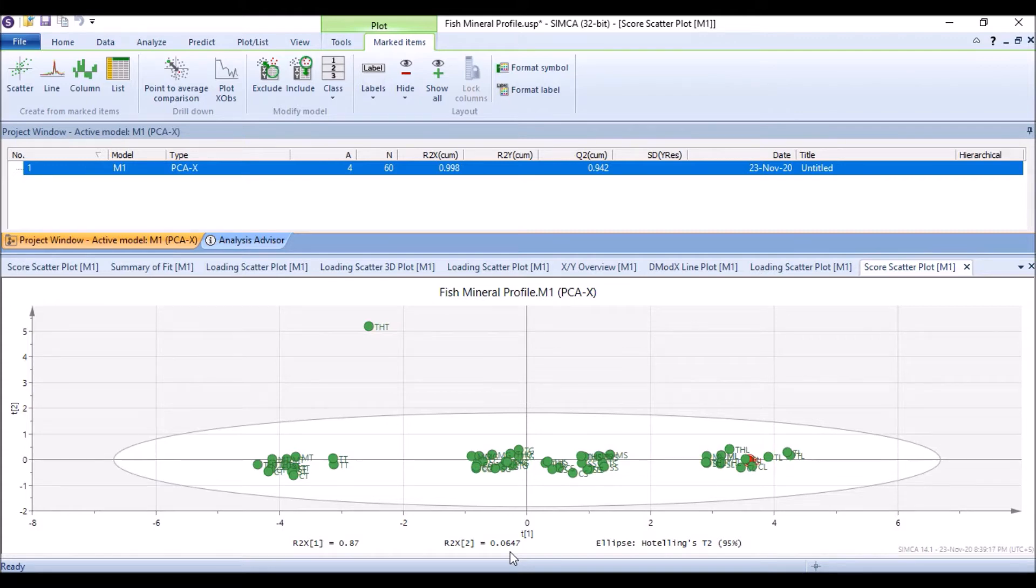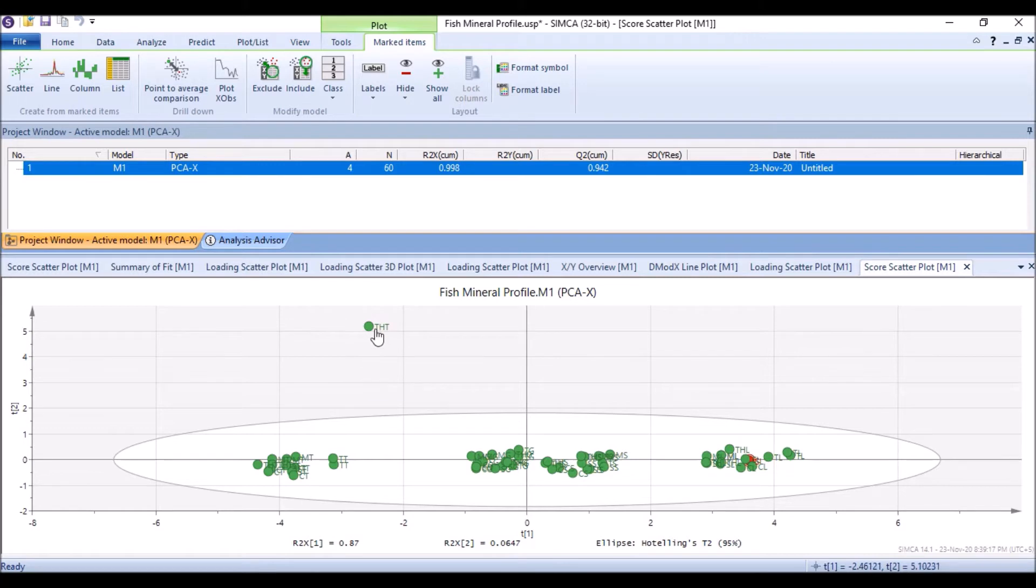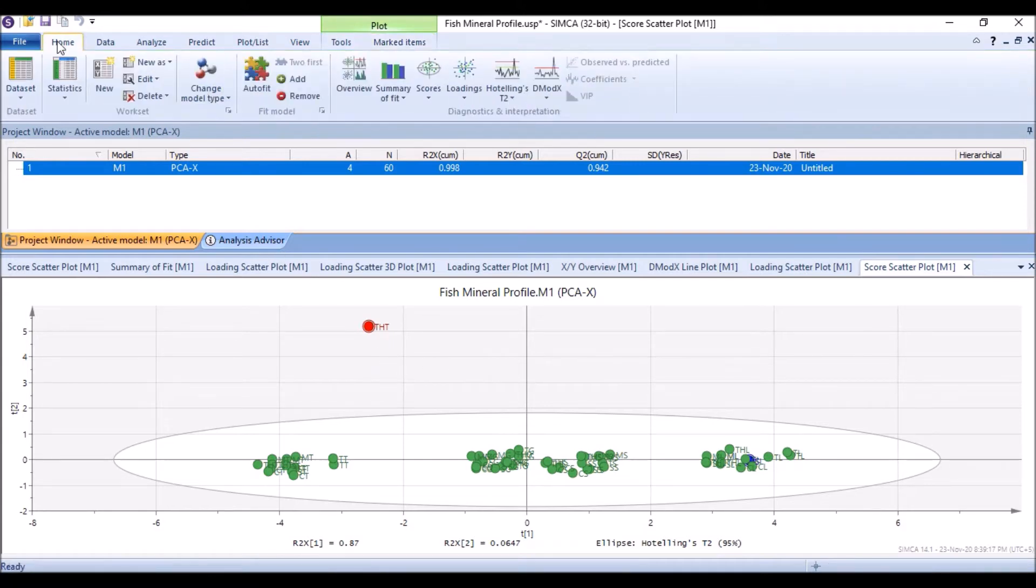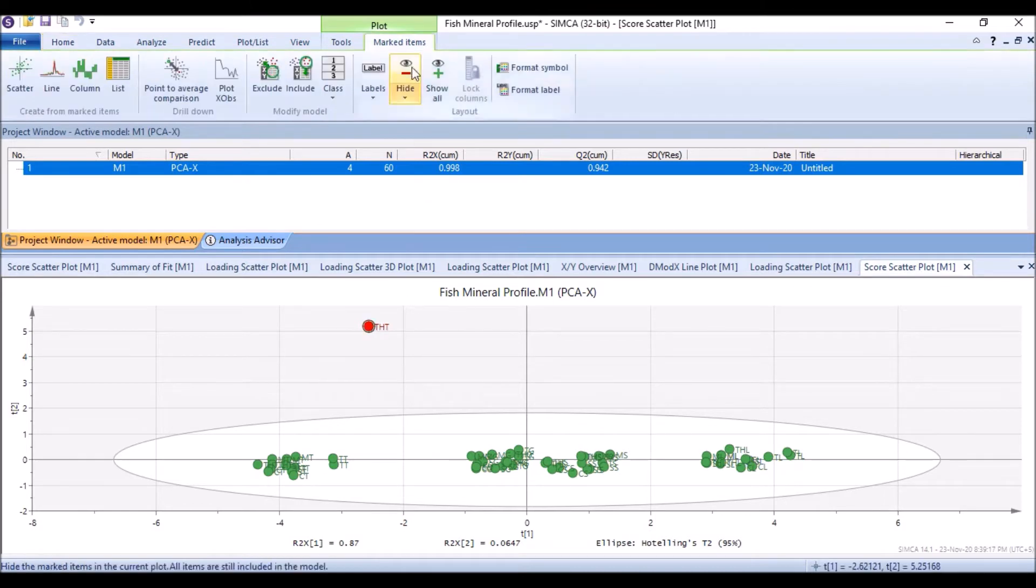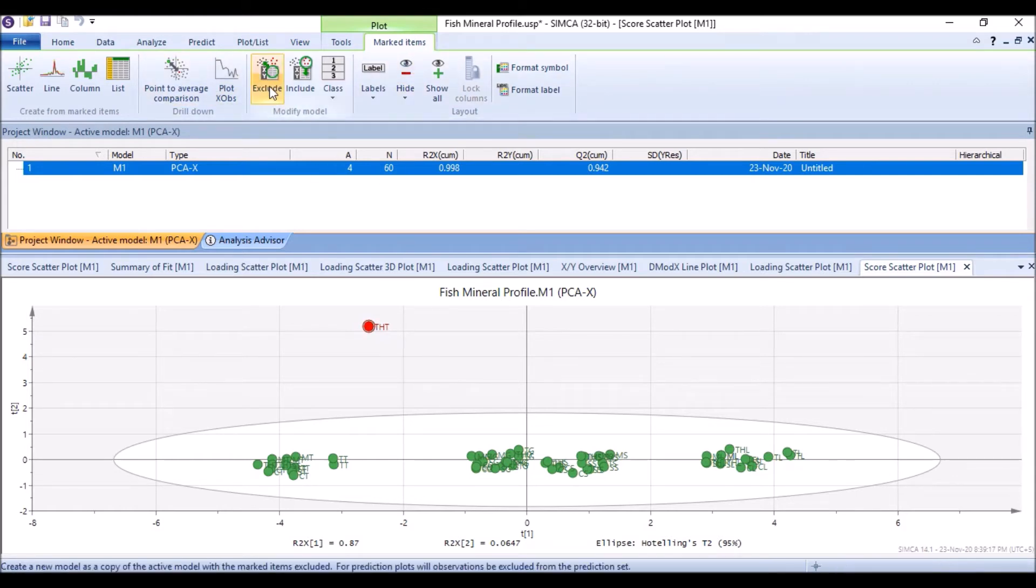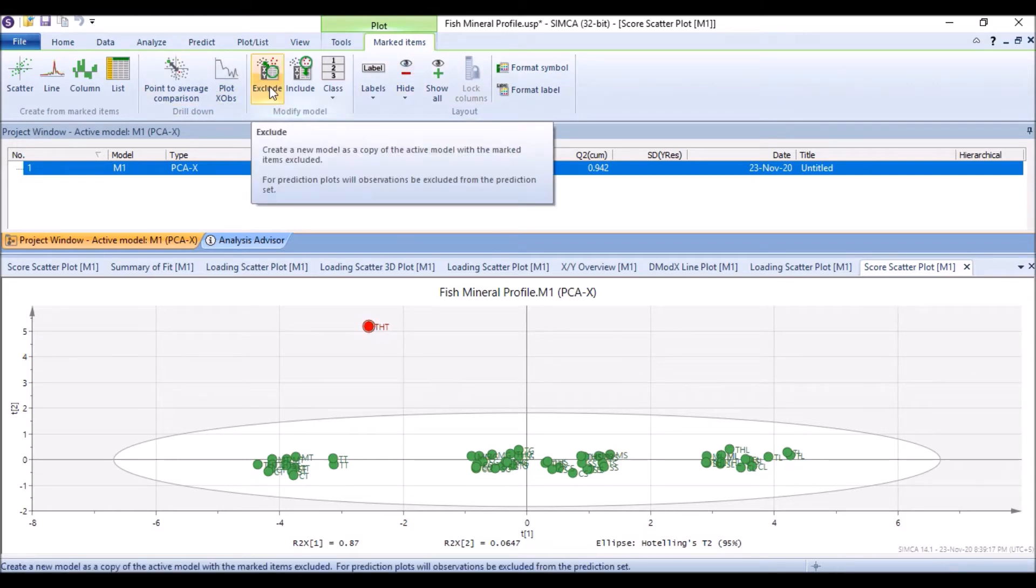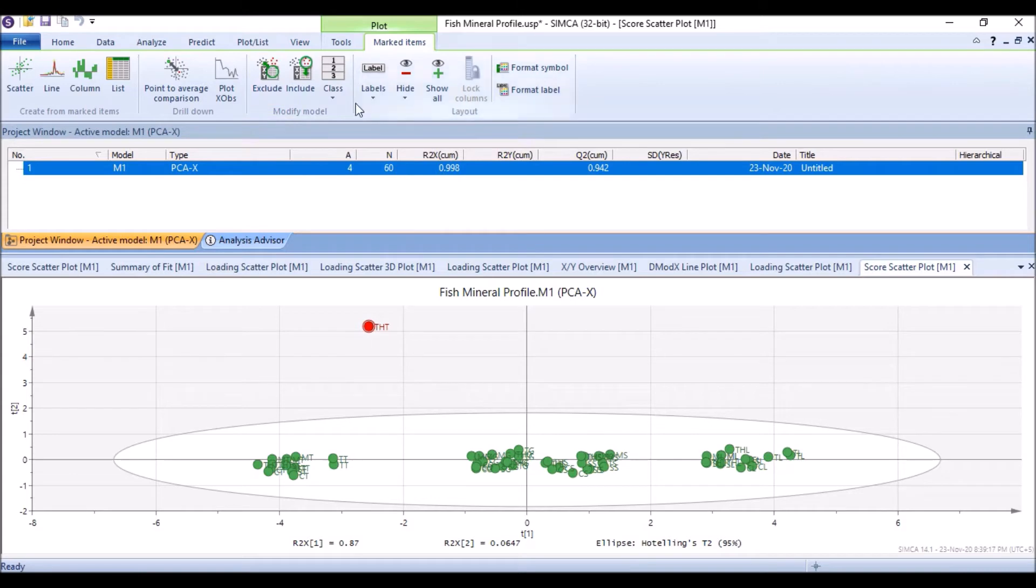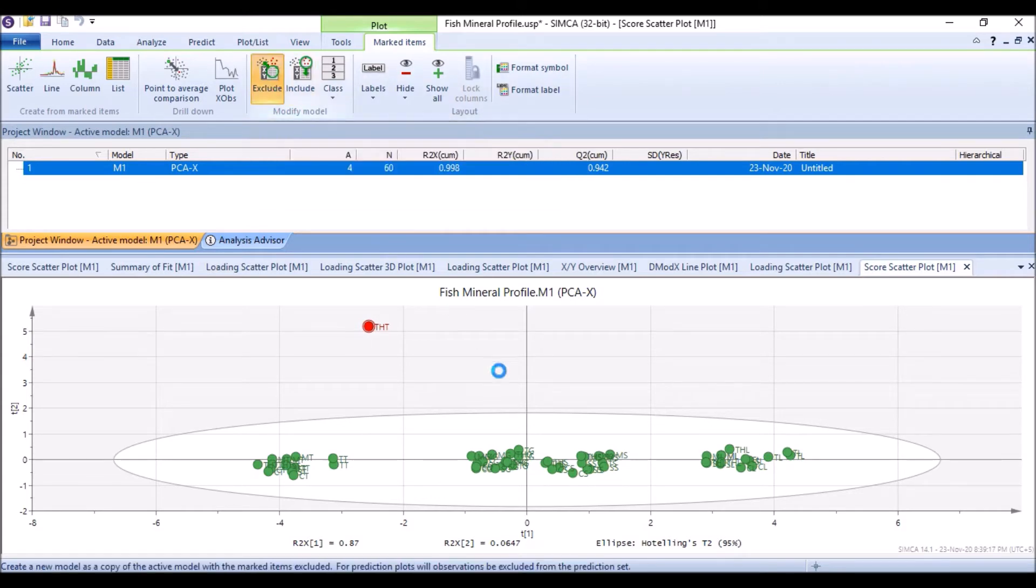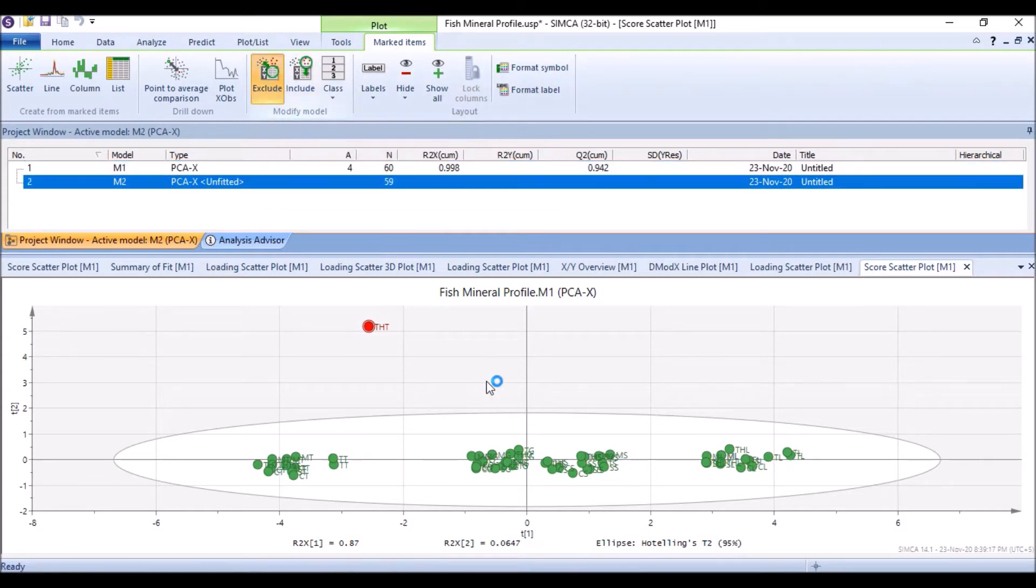We can remove this outlier. Just click on it. When we click on this outlier, by default it goes to marked items. It was at the home, when I click on it we see that this marked items tab is highlighted. Then we have exclude option here, we have include option and we have exclude option. If we exclude it, now we see a second model is generated by default and it has 59 samples.